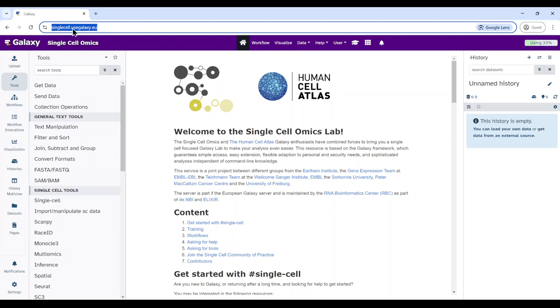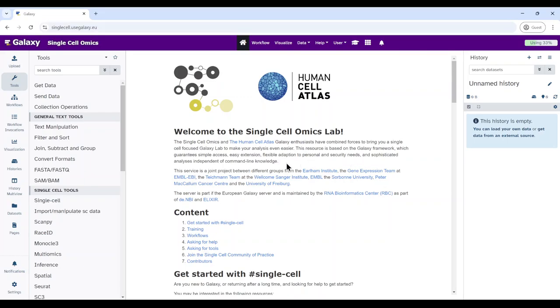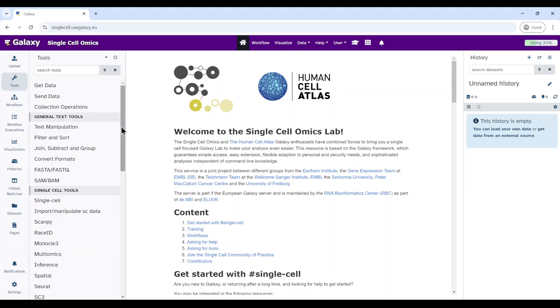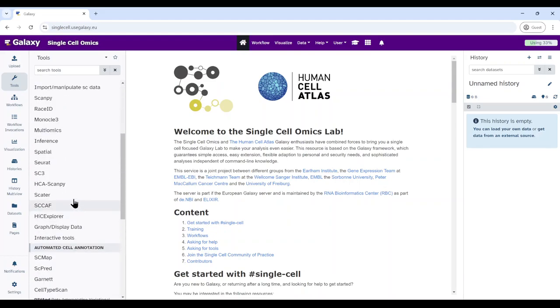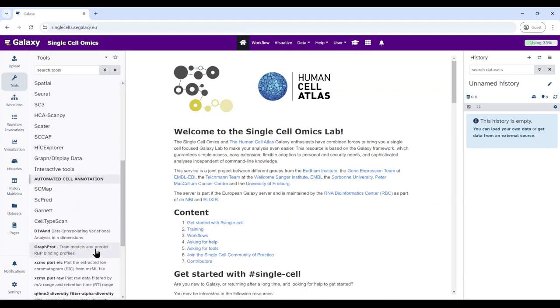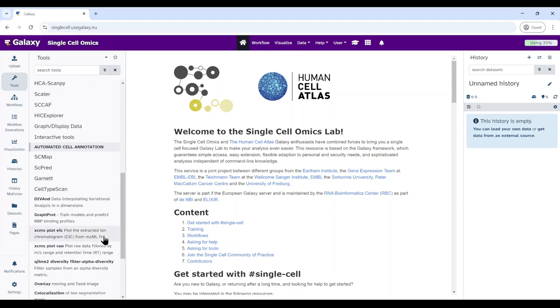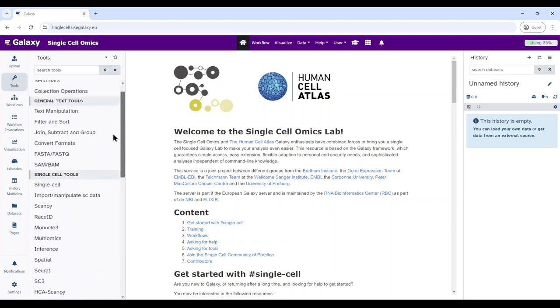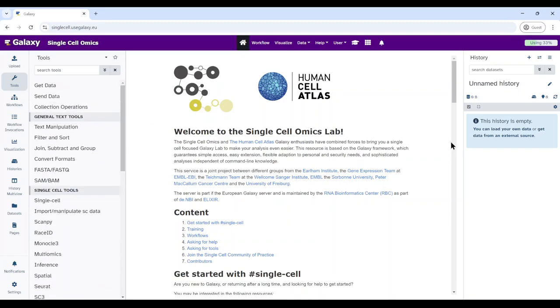I'm using singlecell.usegalaxy.eu. You can also use any other public service like usegalaxy.org or usegalaxy.org.au or any other public server that supports all these tools. In this single cell subdomain, the main advantage is that all the tool panel is sorted out — you have only a filtered list of tools mainly used for single cell data analysis, and also some workflows that support the analysis.